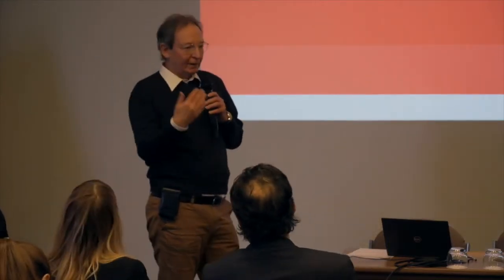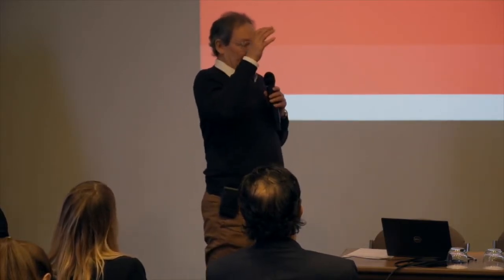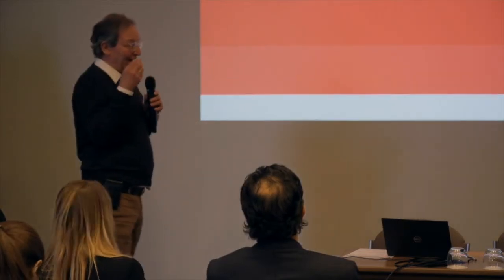What we have with motorized focus levels, we could also tell the system, okay, do an autofocus for every part of the scan. What happens then if it stitches that together is an interesting question. It's going to look strange. I have never tried that.